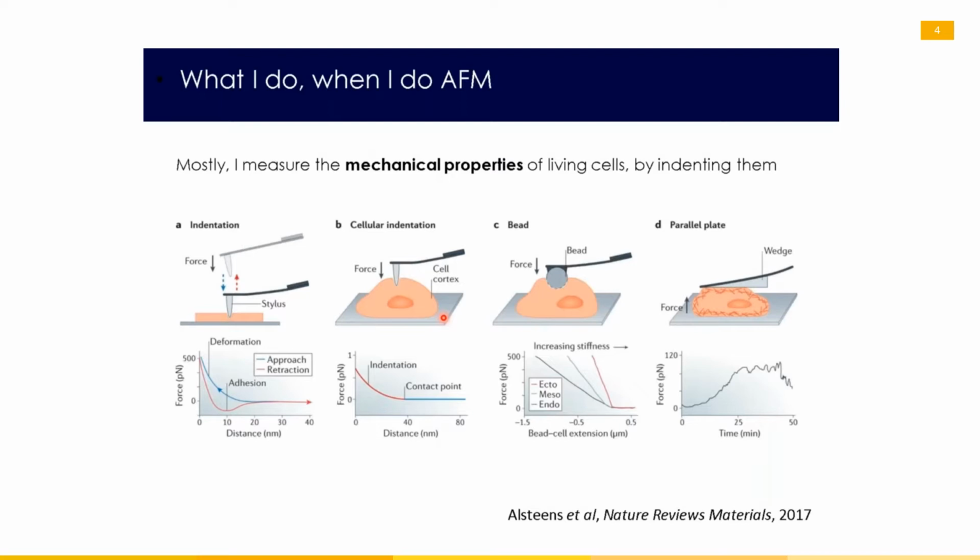When working on cells, keep in mind that they are working on nanoscales and that the tips are not very sharp. Mostly they are blunted. The stiffness of the cantilever is also soft compared to the cell. So in general, we can say that she studies the mechanical properties of the cytoskeleton.